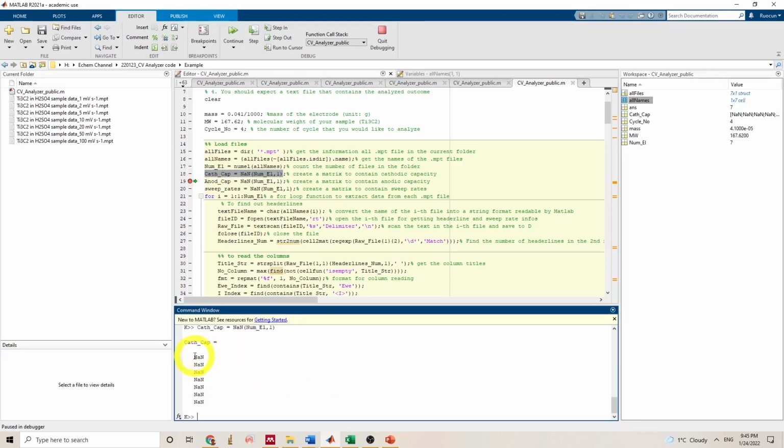Now you will see 7 not a number values input here. What I like about not a number is that if this not a number shows up in Origin when you plot it, those points will just be skipped. If you use 0 to construct a column, then 0 is actually a data point that will show up in Origin plots.